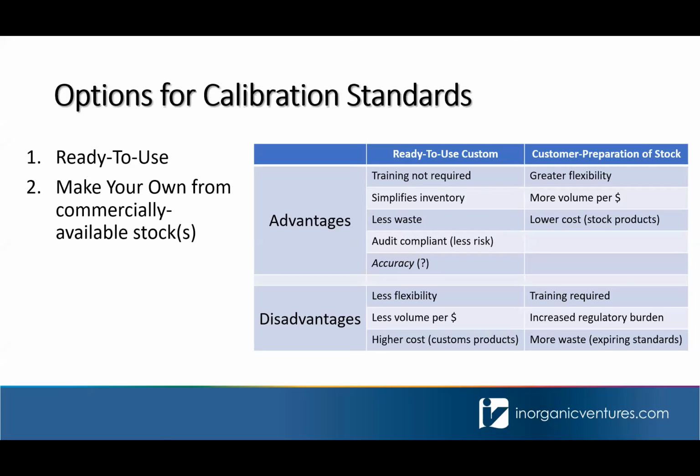Most labs typically fall into the second category. We do have customers that purchase ready to use, but most of our customers are buying some stock and then making dilutions into their working solutions. So this is the reason why I would like to discuss tips and tricks for designing stable working solutions.